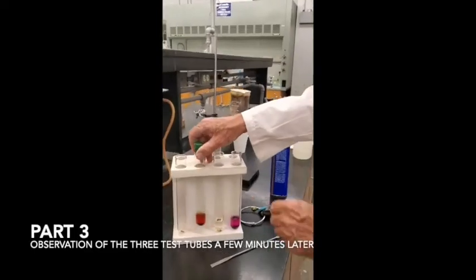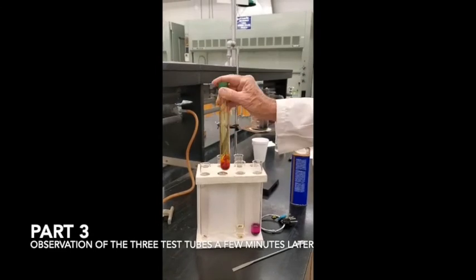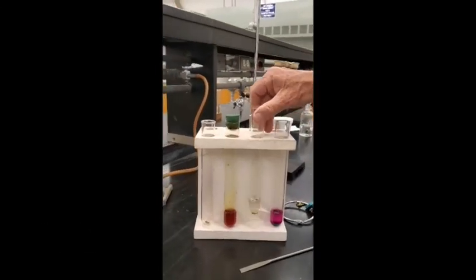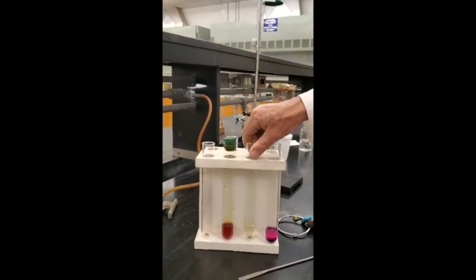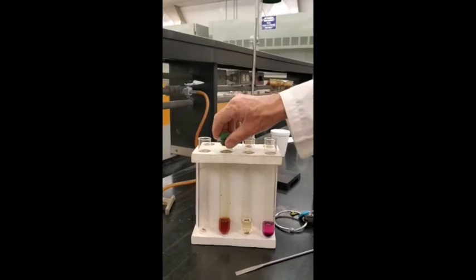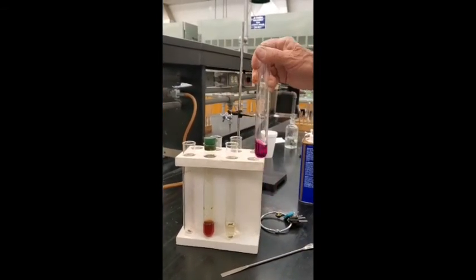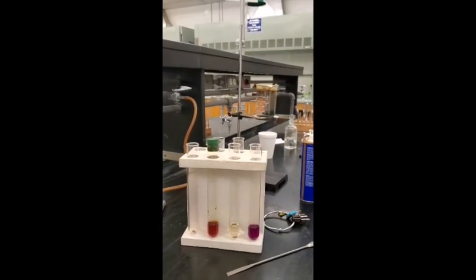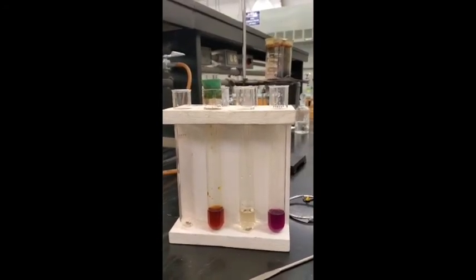Hey everybody, this is the one with the triiodide. I want to shake it up again. See, it's getting darker, right? Brownish color. And this is the one where there's some solubility. You can see a little color in there, but not very much. That's in the water. This is the triiodide, and this is the one with the hydrocarbon mixture. You can see it's much more intensely colored, and that is the iodine color. Same color as the vapor you saw. The iodine is simply dissolving in there to make that.